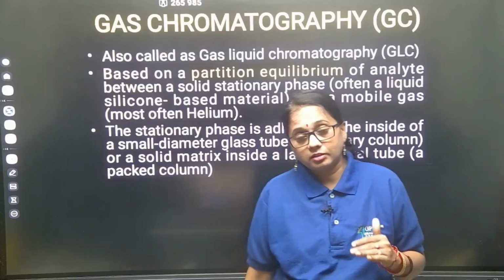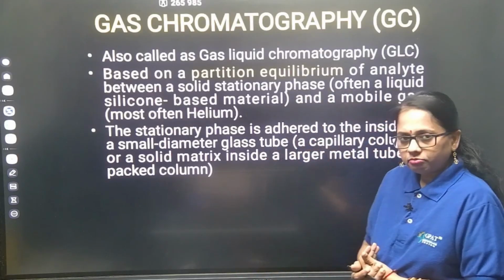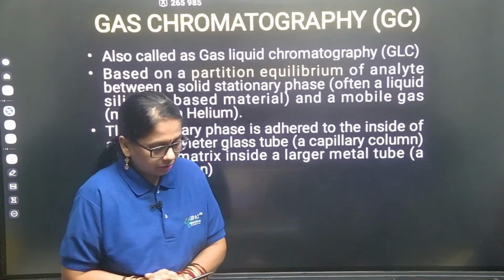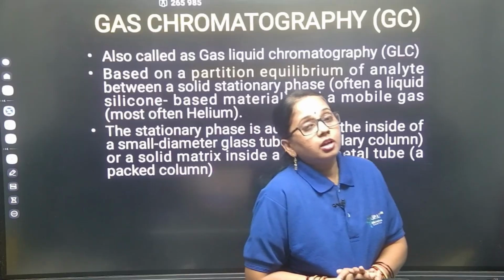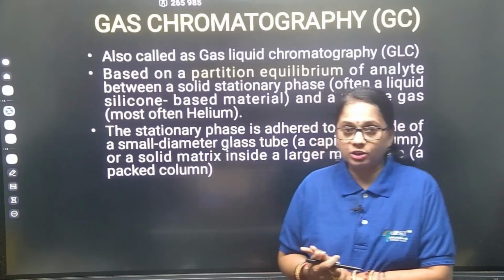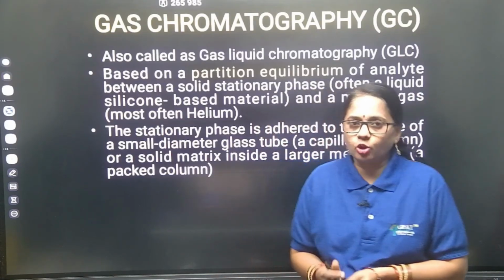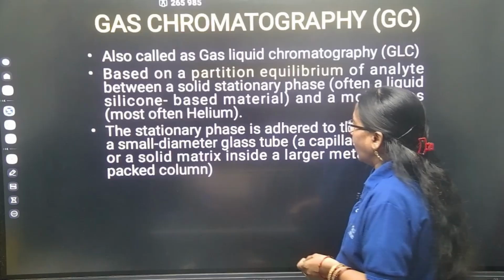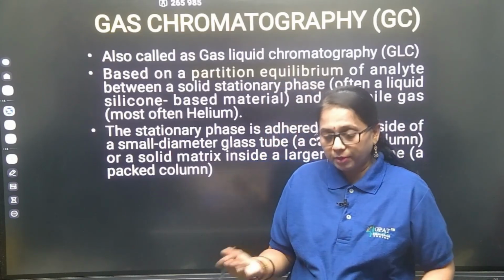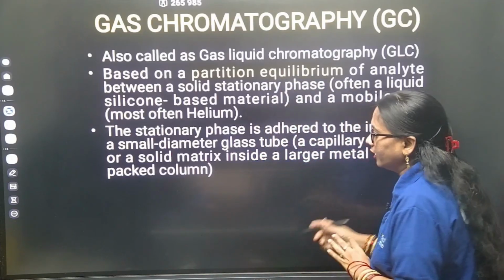that is adsorption chromatography. Here, whatever the stationary phase columns, that means in partition chromatography also, in the case of GC, very lengthy columns we need to use. Capillary columns, packed columns, wall coated columns, support coated columns, like this different types of columns are available for GC. And very small diameter, less than 1 mm diameter columns we are going to use, which we call capillary columns.